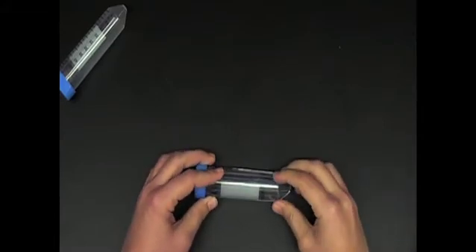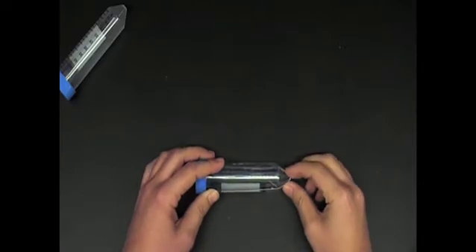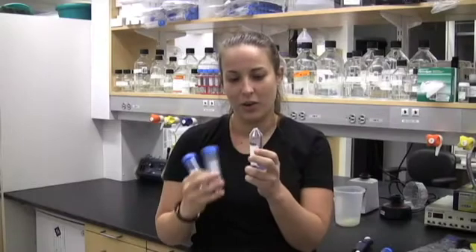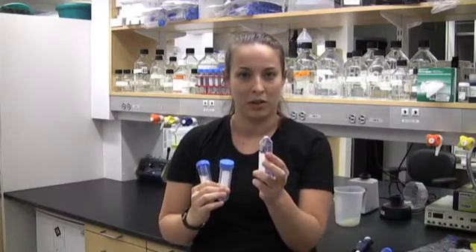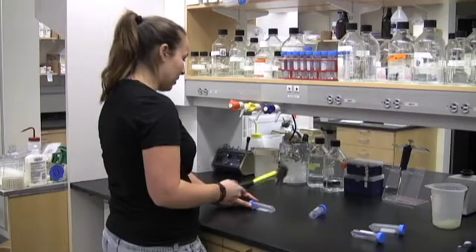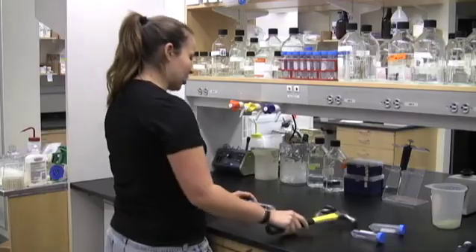This is very similar to what happens when you spin it at very high speed, say for a maxi prep — all of your solution is now in the bottom of your centrifuge. Good luck cleaning that out. Whereas with polypropylene, it's very resistant to shattering.